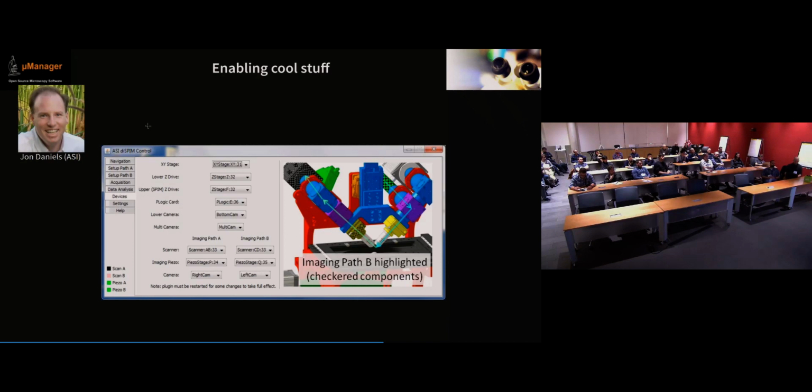It was kind of prompted by me; I thought this would be a great way of showing what you can do with Micromanager, and I started with this, and luckily John picked this up and really made this work. He made this elaborate Micromanager plugin that runs that diSPIM in all its various forms and really makes it go at hardware speed.